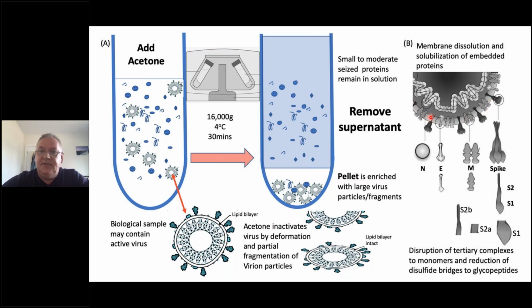So we had developed a series of MALDI mass spec friendly detergents, which will dissolve away the lipid membrane and aid in the ionization of these lipid loving domains so we could actually visualize the proteins coming out. And to make it a little bit easier for us, we also reduced the disulfide bonds. There's an awful lot of disulfide bonds here, holding the complexes together and holding some of the structures together. In particular, this spike complex, not only is it a trimeric complex that we could break apart with our mass spec friendly detergents, but if we reduced it with something like dithiothreitol, which we have been using up until now, we could break the spike protein into several subunits. Typically people understand S1 and S2. What I'm going to show you is that actually there are many more tryptic fragmentation products of the S2B, and that's a very important biologically functional protein.